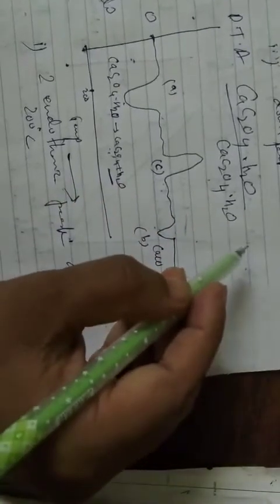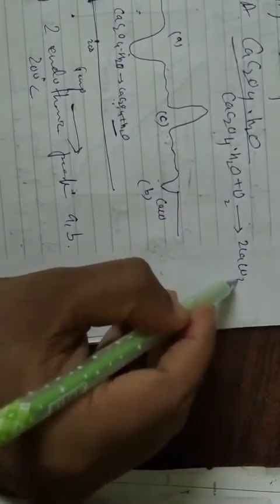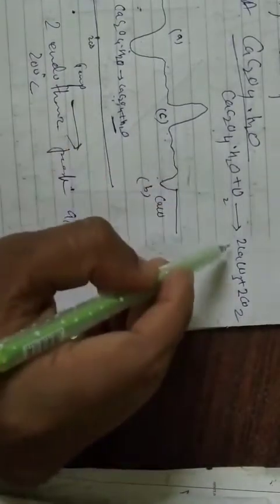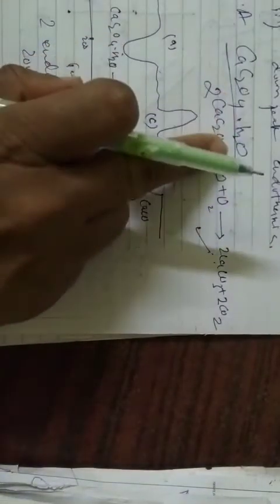The reaction follows: when it is heated in the presence of oxygen, you get calcium carbonate plus 2 moles of CO2. Take 2 calcium oxalate, and just check it for balancing purposes. This is the reaction from the DTA process of calcium oxalate monohydrate.